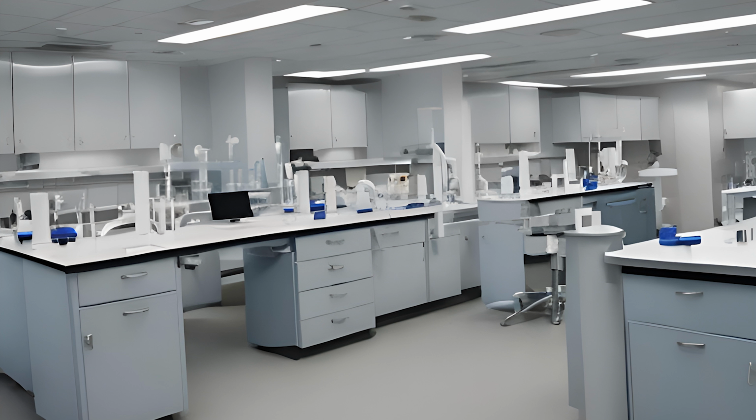A copy of the SDS, the safety data sheet, has to be on file and readily accessible, available to every employee working in the lab 24 hours a day, 7 days a week, and ideally they should be centrally located, easy to find and reference, so that they are at a fingertips distance away in case something goes wrong. Because not everything can be dealt with a 15-minute flush of the eyes with water. That's a good catch-all initial strategy, but it does not work for everything. And your SDS is going to tell you when that's not an acceptable plan.